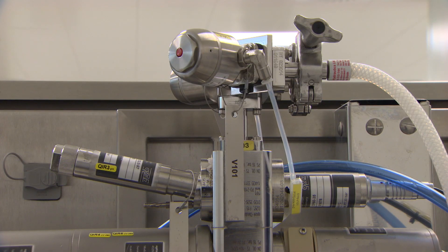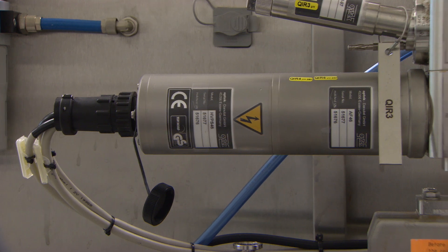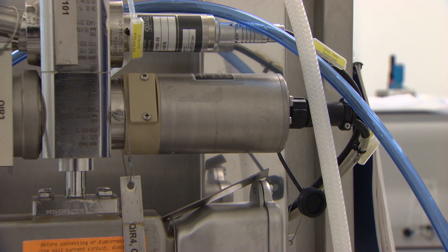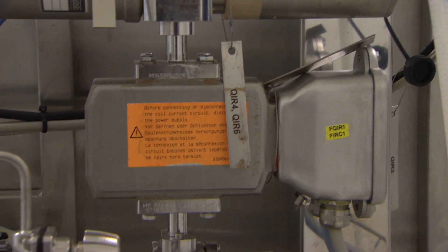At the top of the fluid pathway, after the column, liquid passes through a series of meters which record the liquid flow rate, pressure, pH, and conductivity, while a UV detector with an excitation wavelength of 280 nanometers quantifies the amount of product moving to the product outlet.